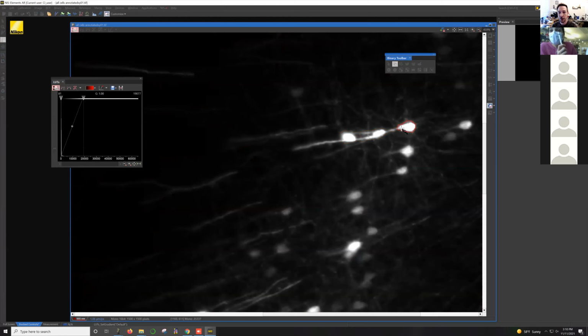And so I can scroll down to what I consider to be the cell, and then just right click. And then I can just go to the next one, right click, and so on. So this is a really fast way of annotating data that might take you a really long time elsewhere, to just get a good result very quickly. Yeah, so hopefully that's very clear.